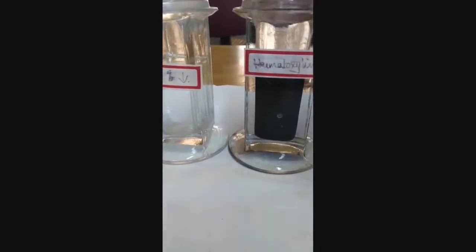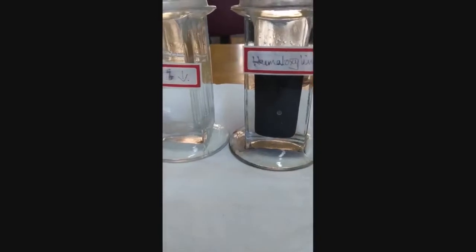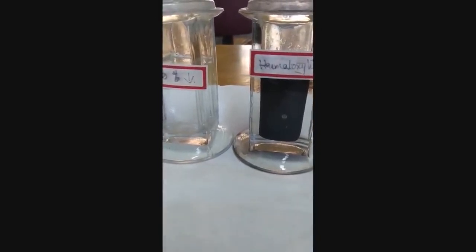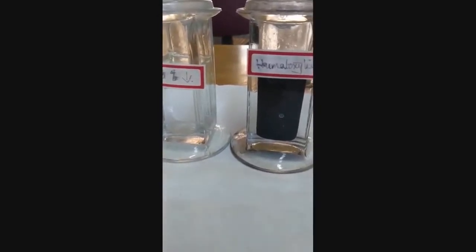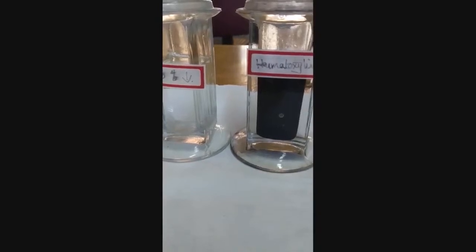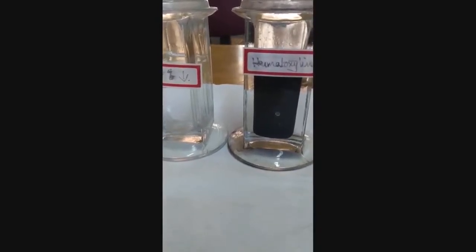Immerse the slide in hematoxylin. Most cells are colorless and transparent, which makes it difficult to observe them under microscope. Therefore, most of the materials and histological sections are stained or colored using stains. Hematoxylin is a basic stain.